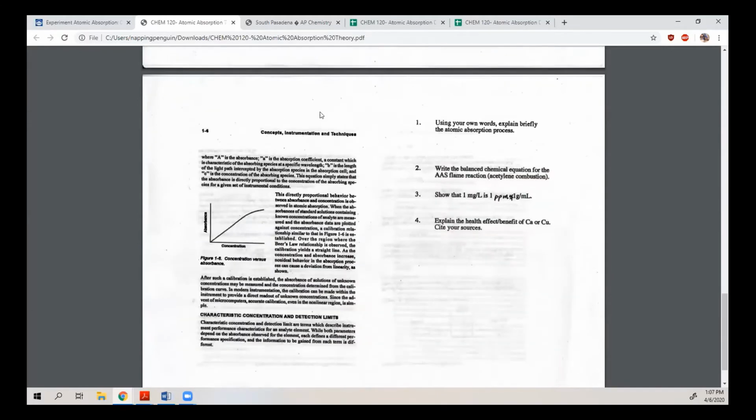We're going to use that to create a standard calibration curve for our material. We're going to measure, for different concentrations of calcium, how much light was absorbed. And then we're going to use an unknown sample of our milk. We'll measure its absorbance, and we'll be able to backtrack that to its calcium. And so that's our background information of what that looks like.